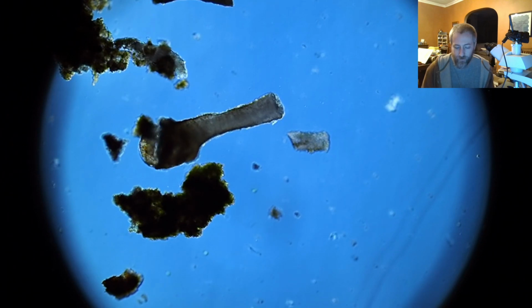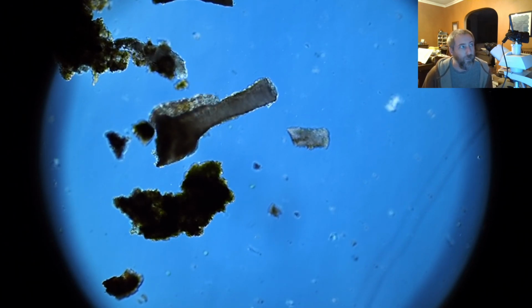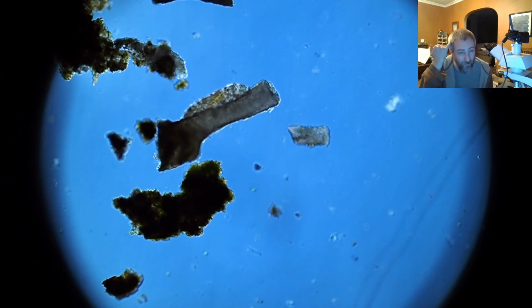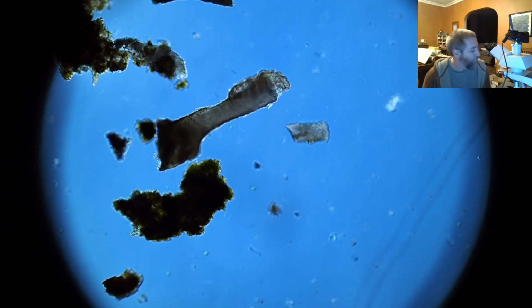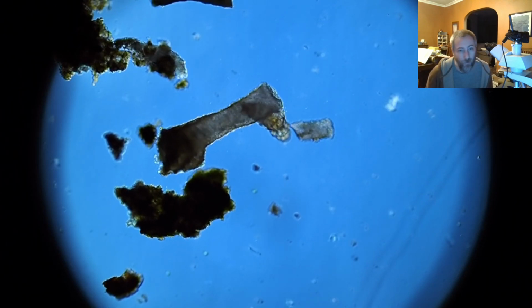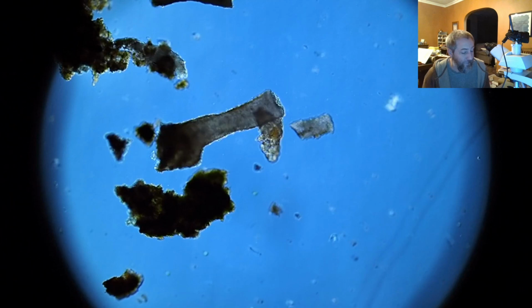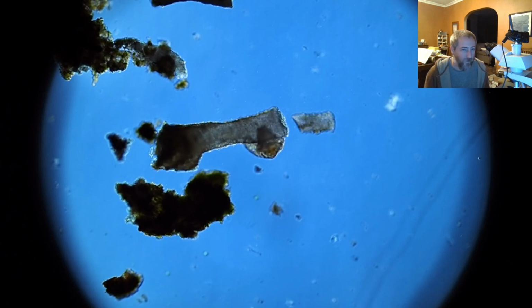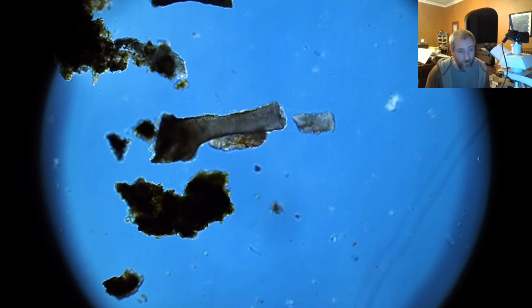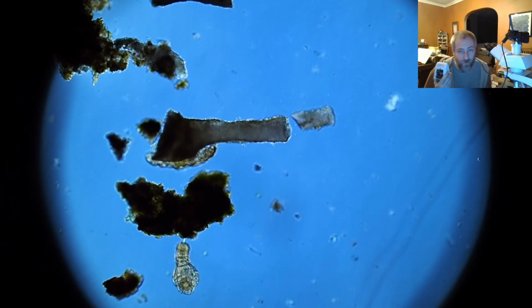But this thing has a 5 megapixel sensor and a pretty slow processor. It's used for taking still photos, whereas my EM1 here has a 20 megapixel sensor and a really, really powerful processor. So it can do 4K video, for example. And I just thought it looks a lot better than the other one, especially because we do a lot of color live video. If I'm taking pictures of diatoms, I think it probably would still do a better job. But I think this is acceptable for that.